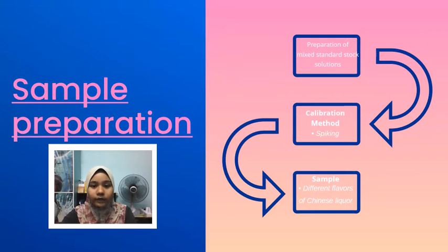To achieve the required levels, 6 vials were made at each calibration level by spiking varying amounts of stock solution in ethanol aqueous solution. The calibration standards were prepared at concentrations of 10, 30, 50, 100, 500 and 1000 micrograms per ml. An internal standard or IS was spiked to each calibration level, corresponding to an IS concentration of 440 micrograms per ml. The spirit samples were obtained locally from retail providers in China and introduced into the GC as test samples.